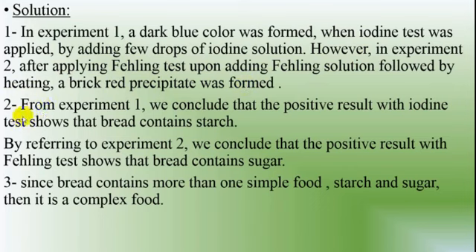2. From experiment 1, we conclude that the positive result with iodine test shows that bread contains starch.